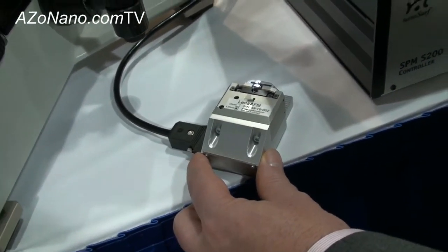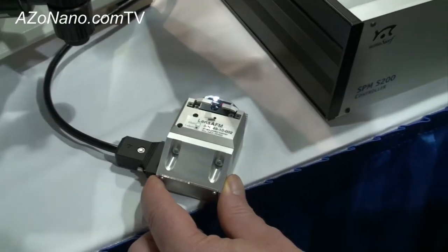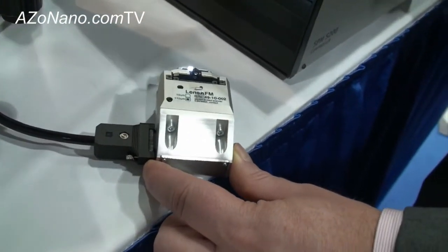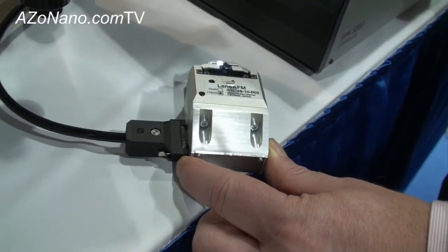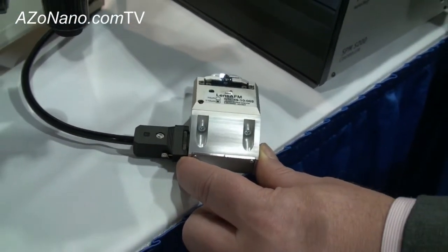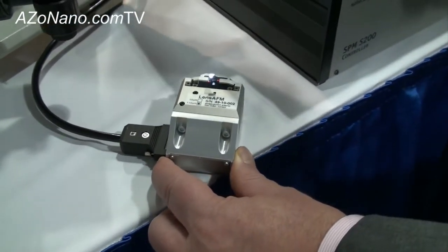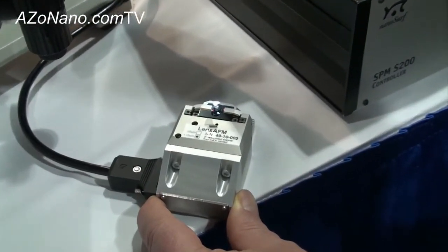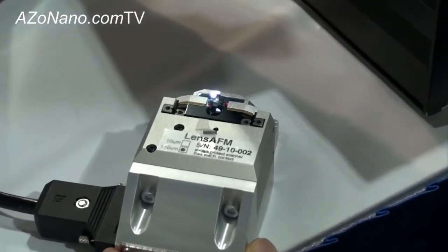The cantilever change is one of our unique features — users do not need to realign the laser when they change from one cantilever to another. We use a special pre-aligned laser setup so that new users or expert users, all they need to do is change the cantilever from an old cantilever to a new cantilever, and they're ready to start imaging.